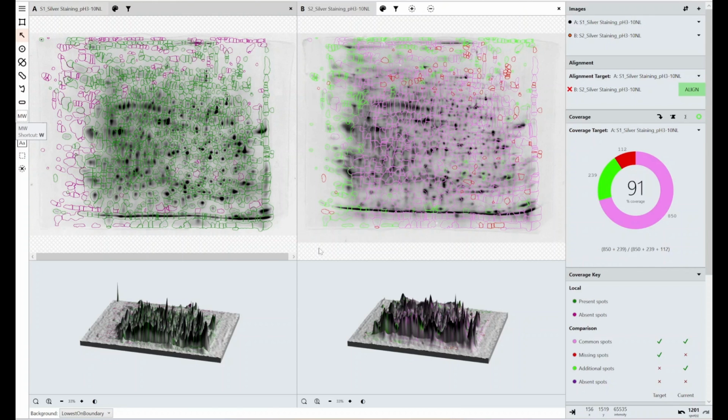When you're performing a host cell protein analysis using a mass spec machine, what you're doing is breaking your protein down into all these tiny peptides and then trying to detect them based on their molecular weight and isoelectric point, and then working that back to say, we think the likelihood is that these peptides were from this protein. An analogy would be arriving at the scene of a car crash, trying to find all the pieces of a car, and then trying to work out what cars were involved in that crash. It's a situation where you're working with a best guess scenario.